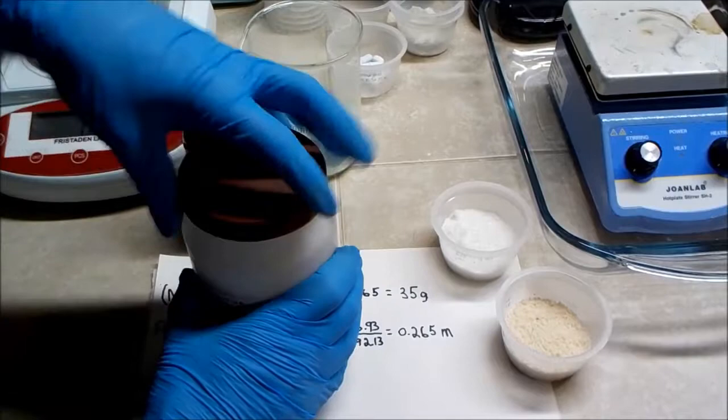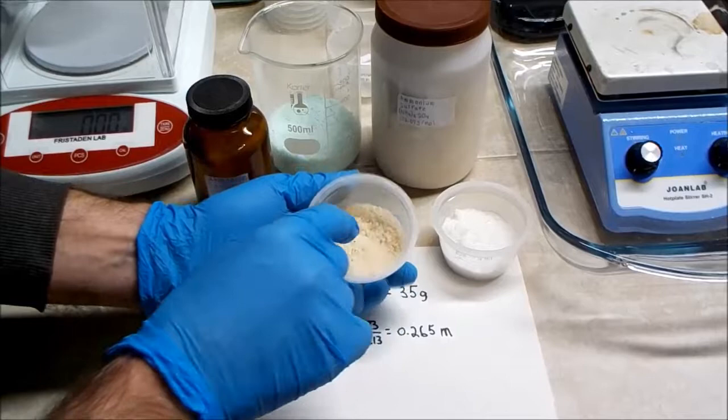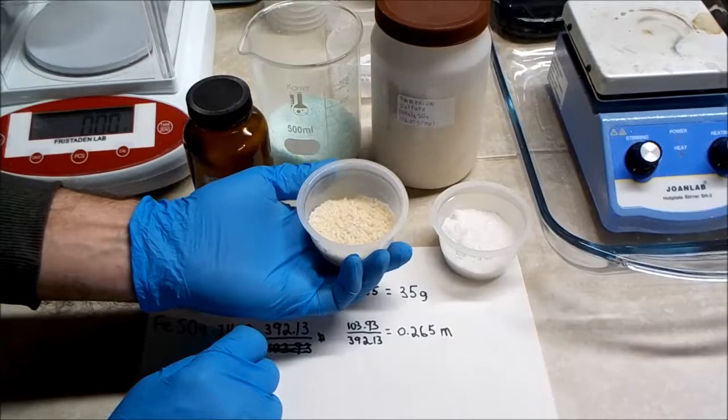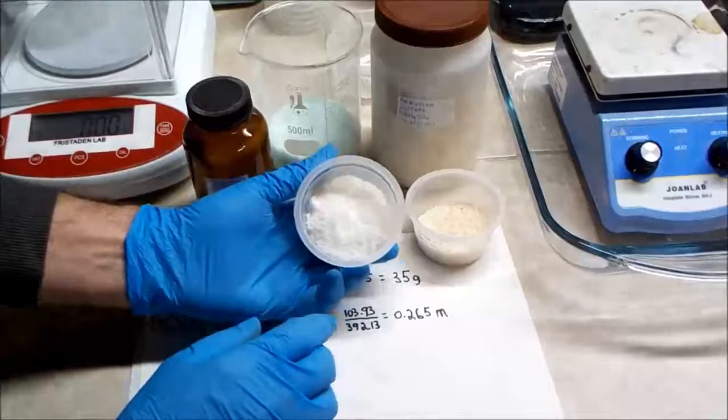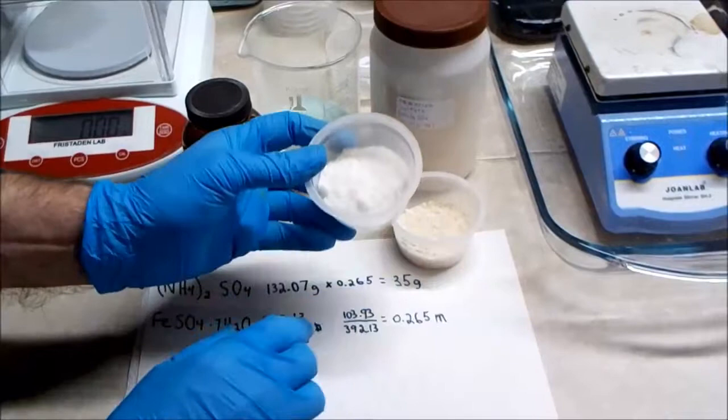And if you buy it as fertilizer, it's probably going to look something like this. It comes in these little prills, but it's not very clean. You can see it has sort of a brown tint. So here's some ammonium sulfate after I've dissolved it in water, filtered it, and then recrystallized it. And this will be much more pure. So this is easy to get, but you may have to do a little work to get it cleaned up so we can use it for this experiment.